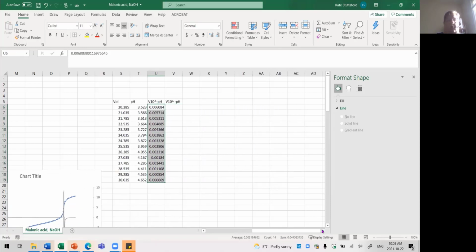All right, so our graph is this value versus this value. So I'm going to highlight the whole thing, and I'm going to highlight this next column. You notice I have two columns labeled the same way. And as I said, there's method in my madness. I want an empty column.